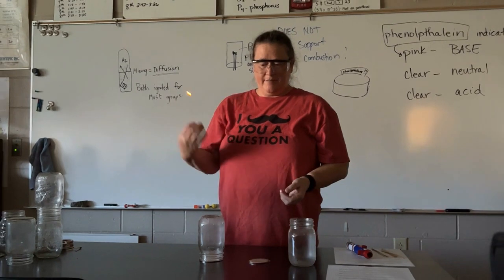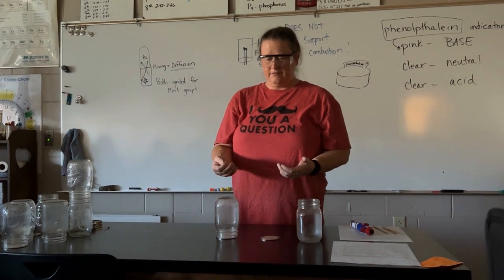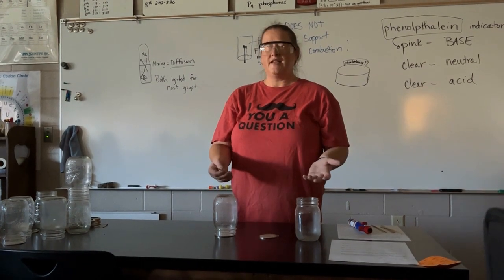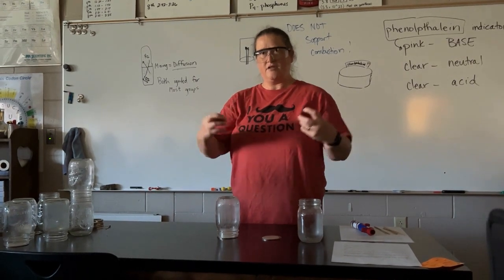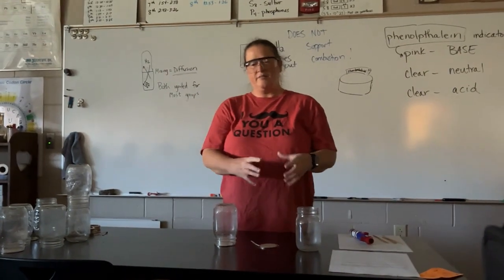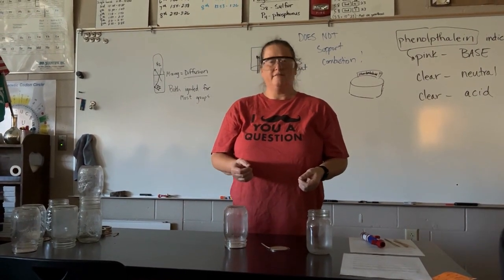Sometimes when I've done this in the past, it's been a little bit more loud and exciting, but we did see each of them ignite, and I hope that you saw that it wasn't a really gentle burn, it was just a little more explosive. So hydrogen will burn very gently if it is pure hydrogen, limited oxygen supply. When it is mixed with air or oxygen, it burns more explosively.